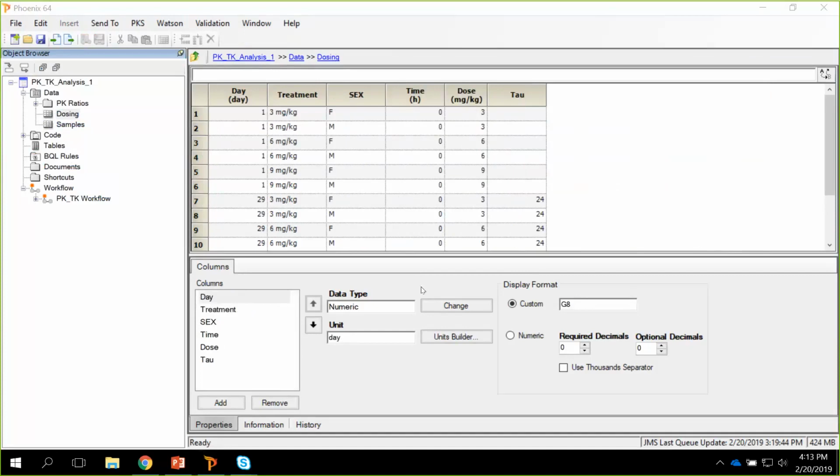Oops, what is that? Are you still seeing the slide? The Phoenix? There was some error. Anna? We can see your Phoenix.